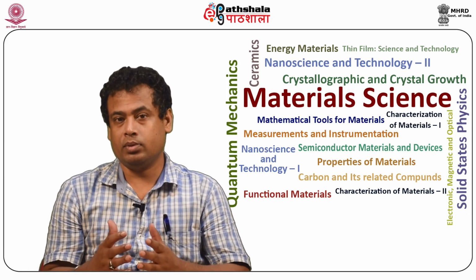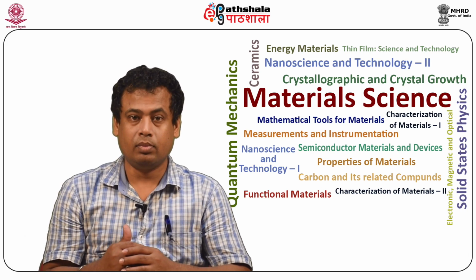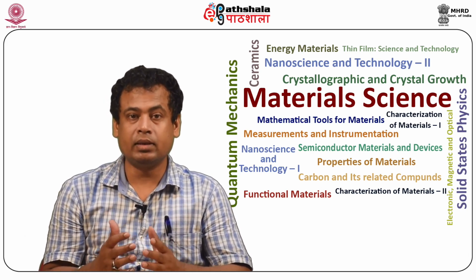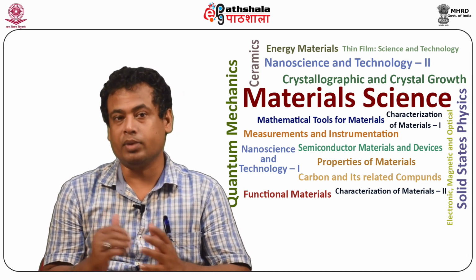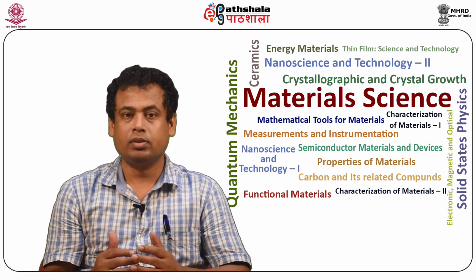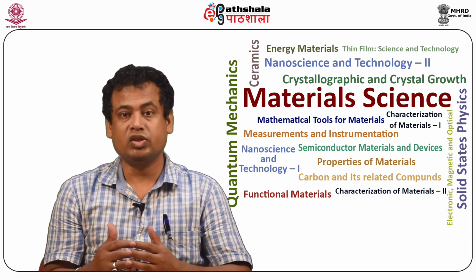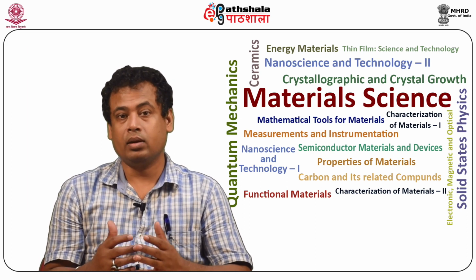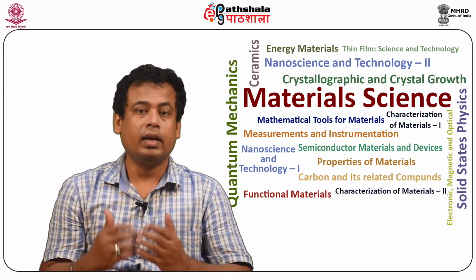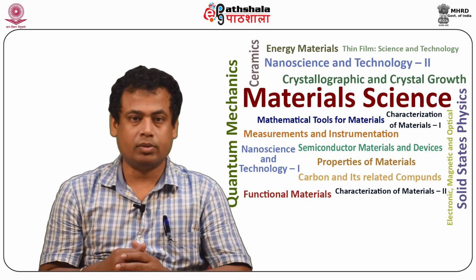The electron beam is scanned in a raster pattern, and the beam's position is combined with the detected signal to produce an image. Specimens can be imaged in high vacuum, in low vacuum, in wet conditions, and at a wide range of cryogenic or elevated temperatures with resolution better than 1 nanometer.